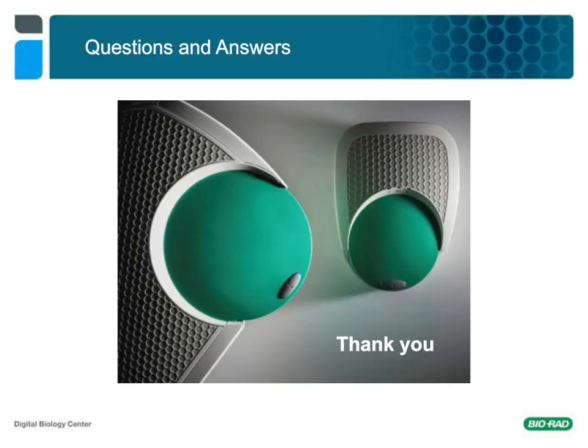Extrapolating into the future, maybe. Right now, the current device is not a point-of-care device, really. If we're talking about point-of-care devices similar to some of the viral or infectious disease tests that are out there, the reading of the droplets, as I said, is similar to a flow cytometer in cell biology, and similar to that, it's a kind of bulky machine in that sense.